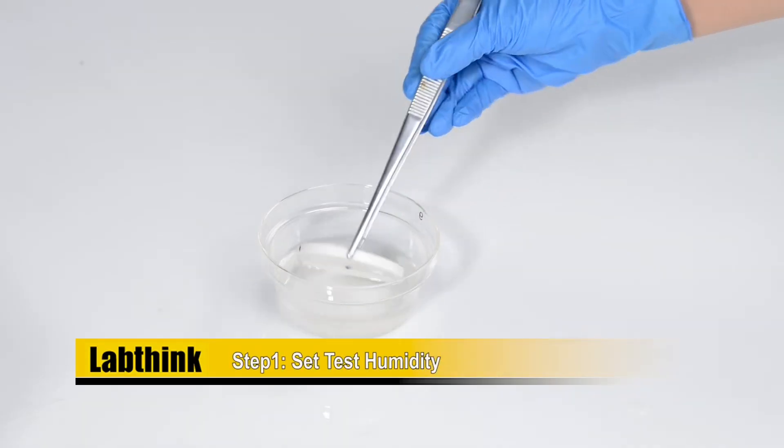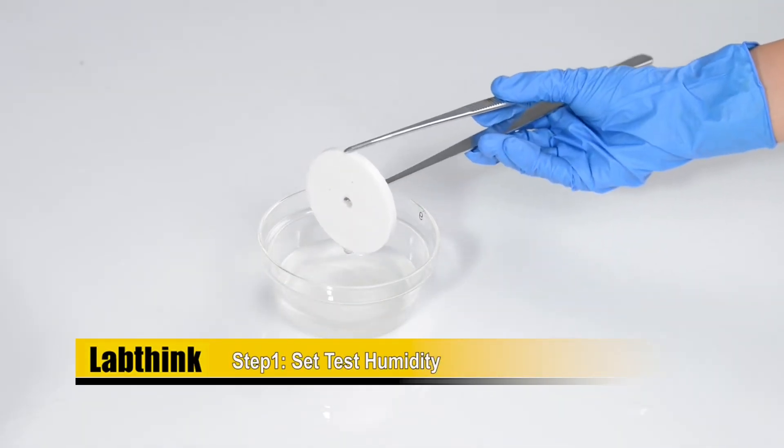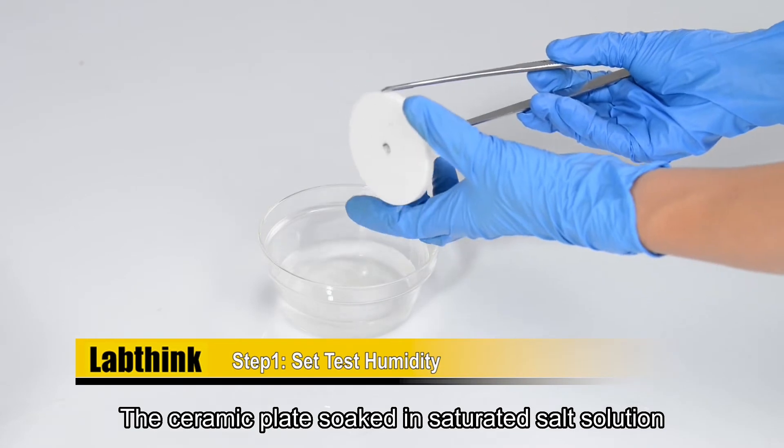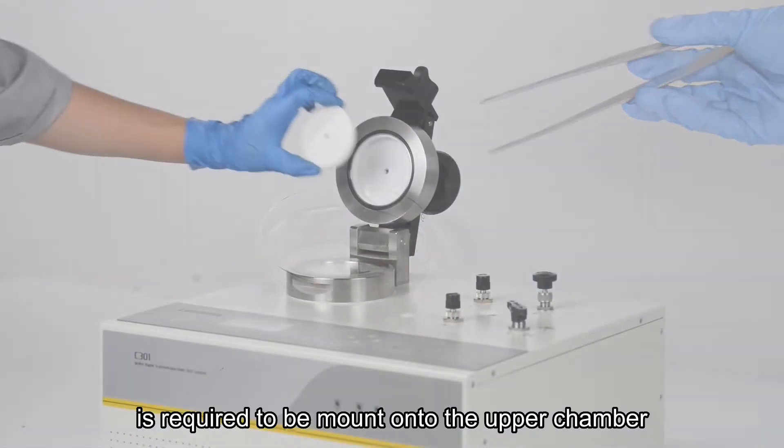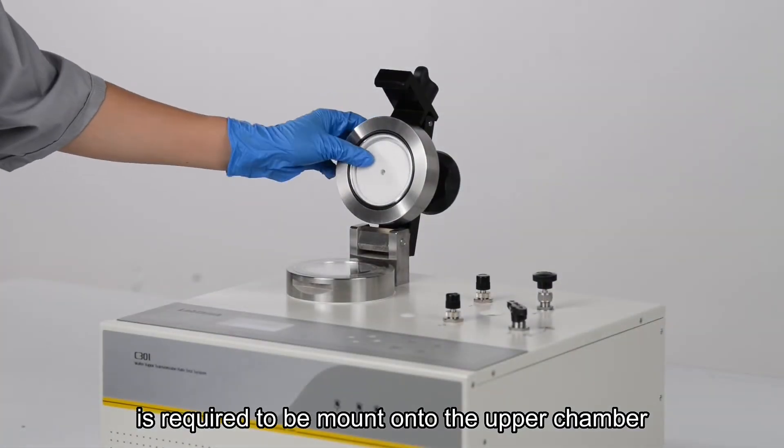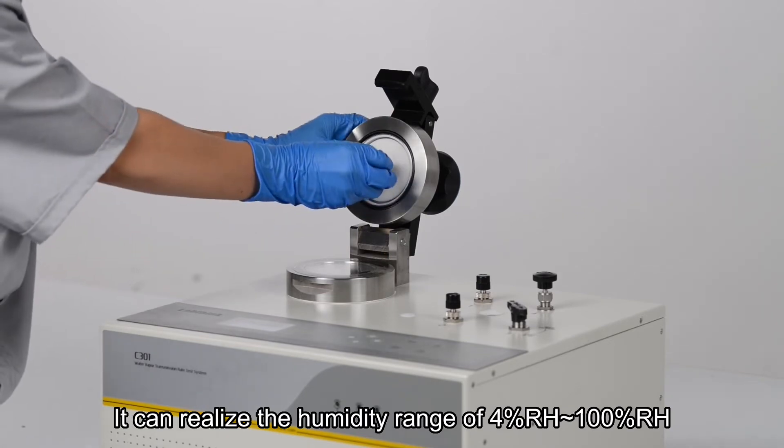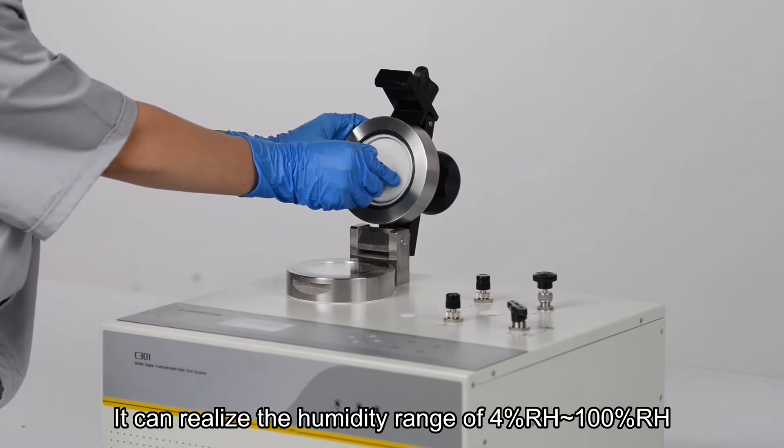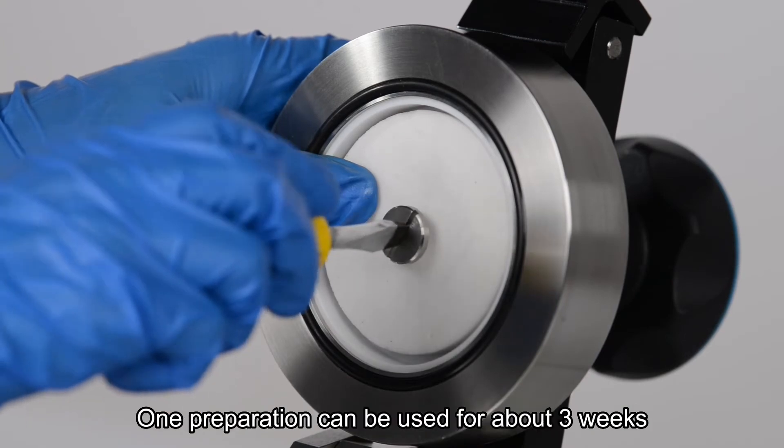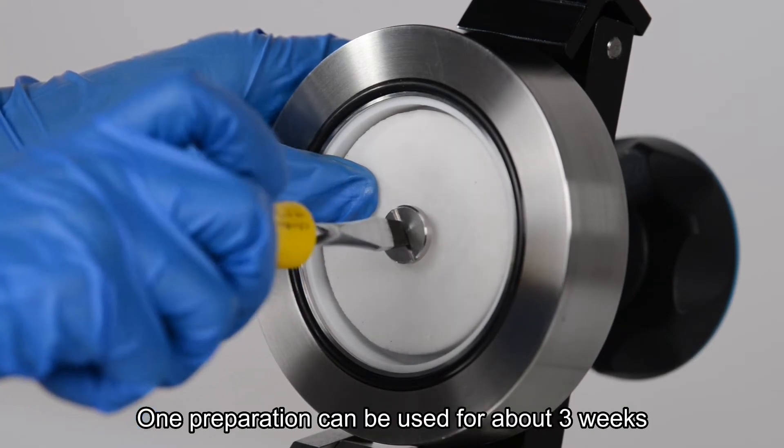Step one, set test humidity. The ceramic plate soaked in saturated salt solution is required to be mounted onto the upper chamber. It can realize the humidity range of 4% to 100% relative humidity. One preparation can be used for about three weeks.